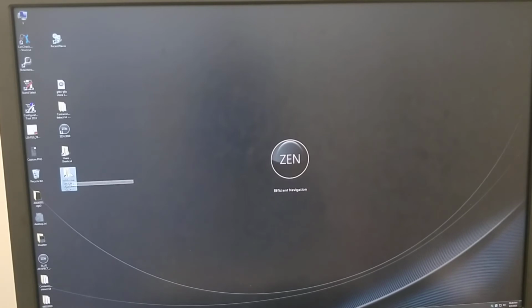And over there, you're going to have the same folder called molecular imaging platform shares. Once you put your file there, you can access your files through there, okay? But keep in mind that this is not really storage, it's more for transferring your file. Once this is full, we're going to completely wipe it out, okay?